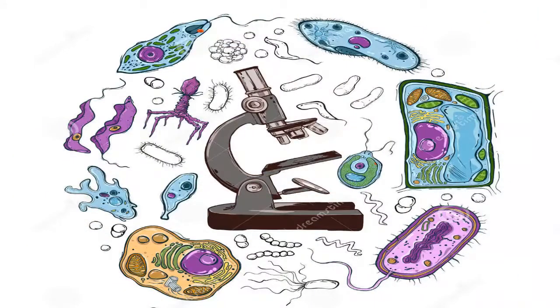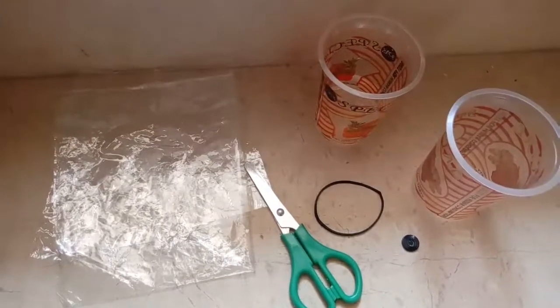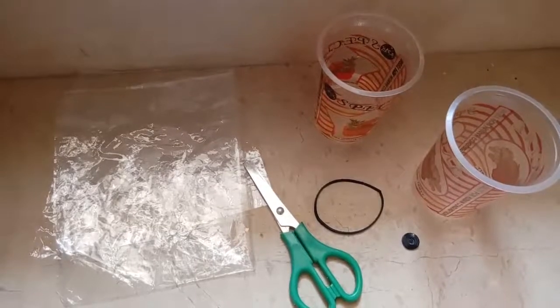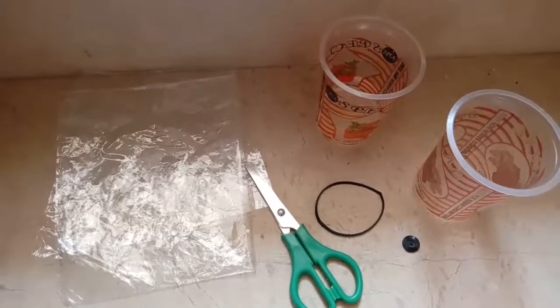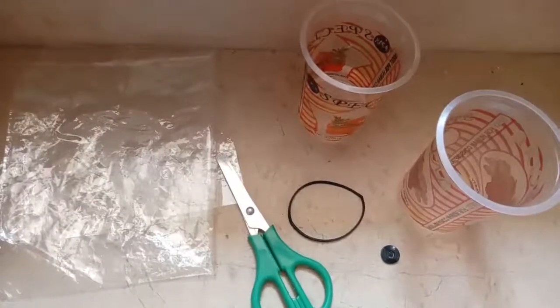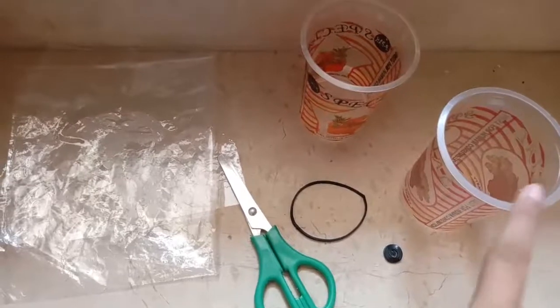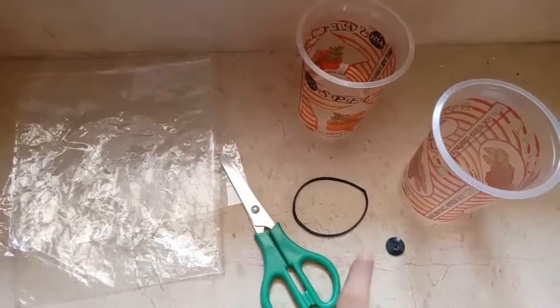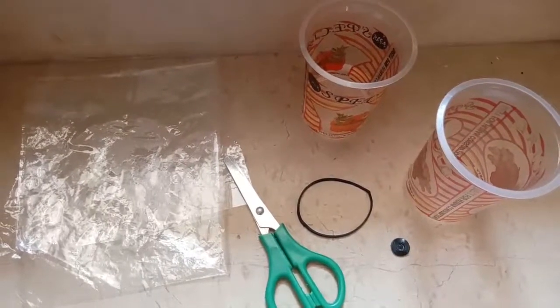In our previous class, we discussed microscopes and microorganisms. Now, my dear students, we will do a very interesting activity regarding a microscope — how we can make a simple microscope by ourselves. For this purpose we will require some materials: a plastic cup, a thin plastic sheet, a rubber band, scissors, and a tiny object.